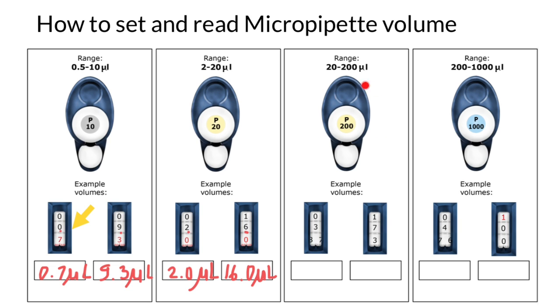Now let's move to the next micropipette, P200, and the range is between 20 and 200 microliters. Now it is a little bit confusing. What should we put here? So this is three, but what do we have here? Is it three and seven and something in between?